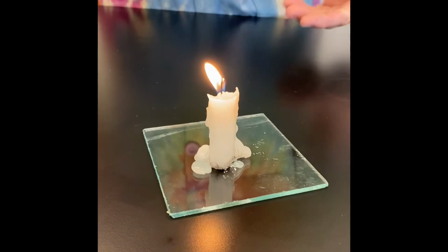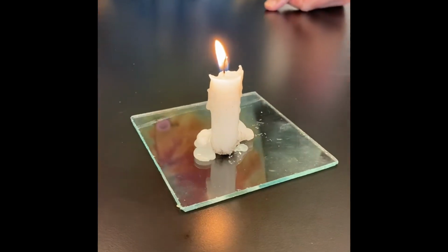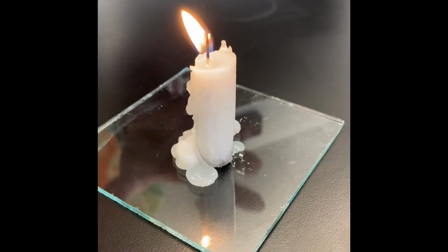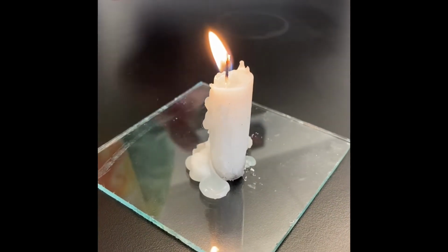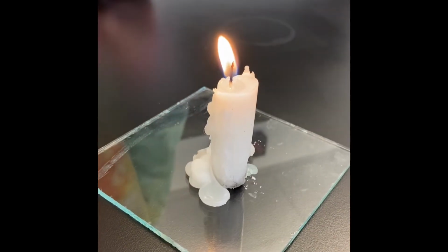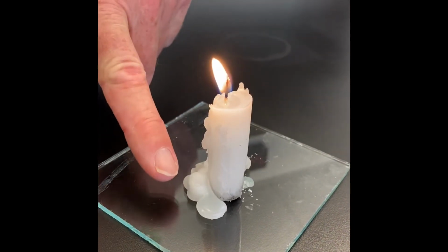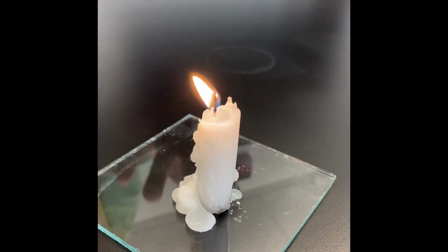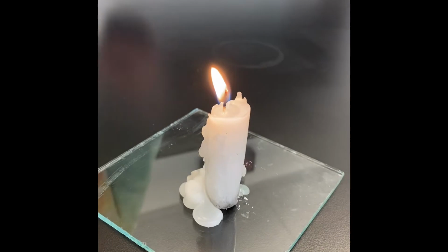It has been about 15 minutes since we lit the candle, and notice the difference that we have here. The candle is significantly smaller because a lot of that wax has burned. It has burned away. Some of it has dripped down here on the side. As you can see, it's still dripping. But the big thing is the candle is significantly smaller.